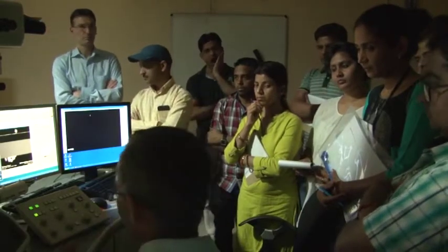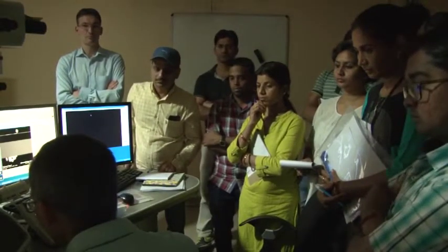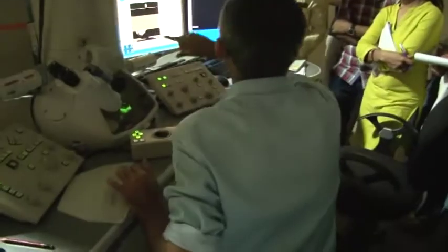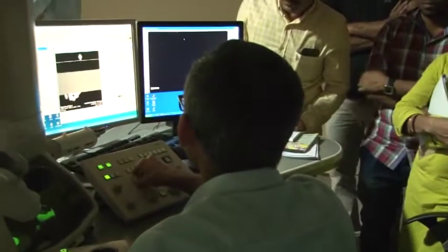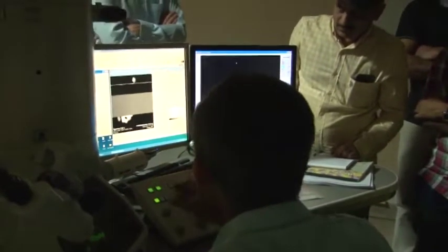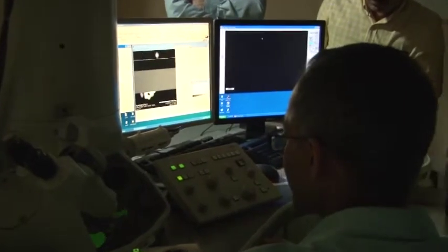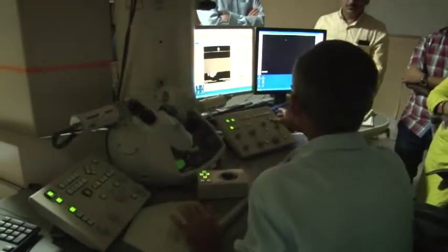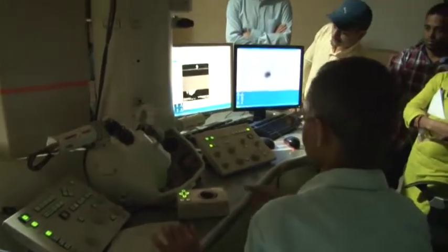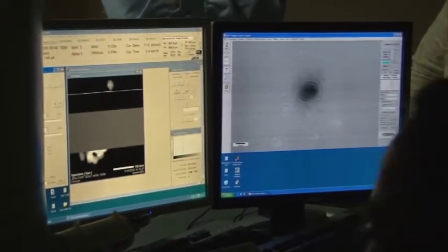In order to check that, we put in one nanoparticle, for example, and this step can be demonstrated on the screen. For this, I go to high magnification, at least 100K. So we are at 100K and maybe even a little more. I will make the intensity a little weaker, and we go on the screen. Okay, so this is how it is.